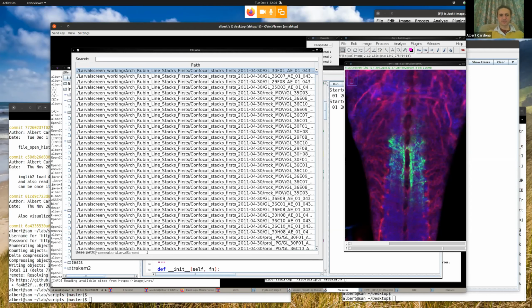And so at the very bottom, you notice there's also a base path. What does that mean? So what I've created here is a program that I'm going to walk you through slowly. But what it does is you give it a text file that contains for every line a file path, a relative file path to an image or to a file. But it should really be images. Why a relative file path? Because I'm expecting the number of files that you have is so large that you're not going to have this in your laptop, but you may access it from your laptop.